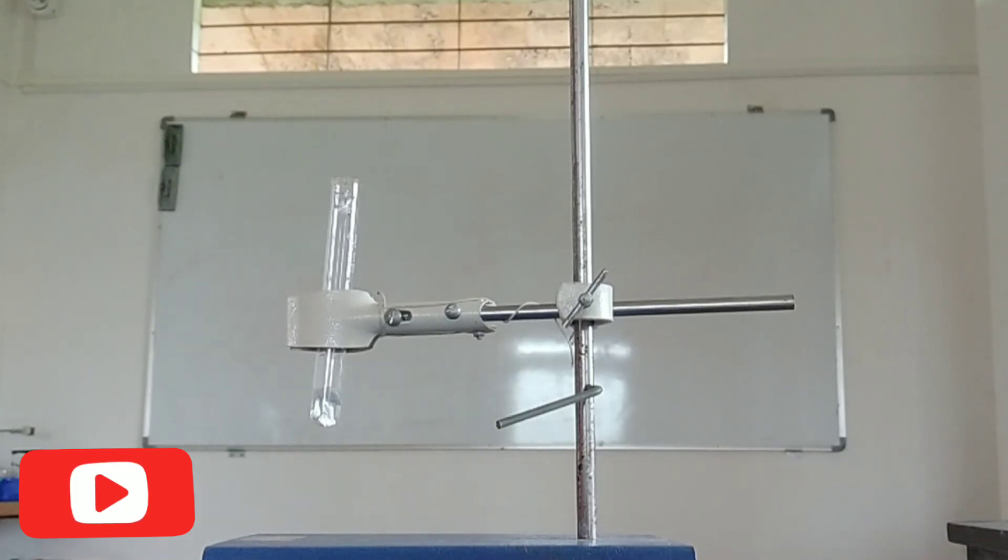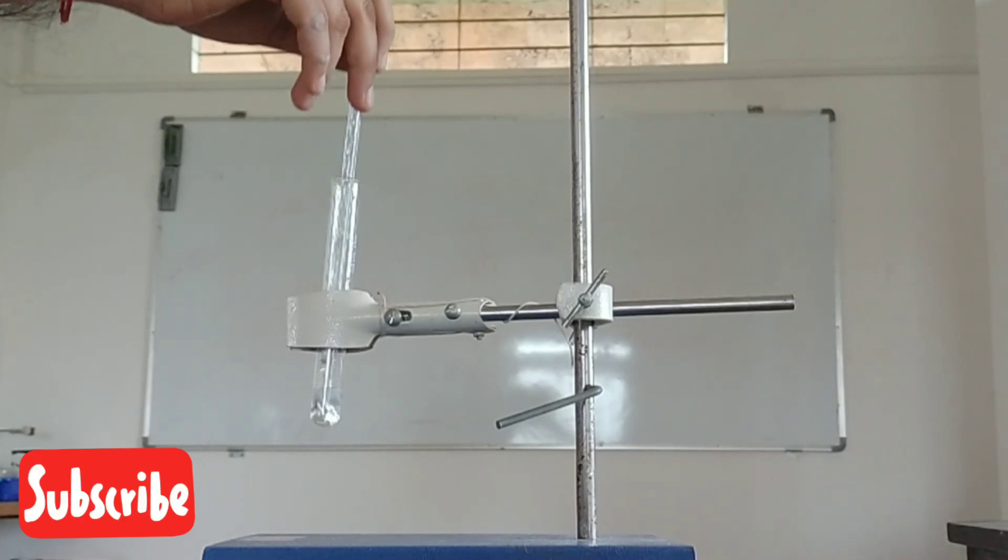I have taken hydrochloric acid in a test tube. Now I will add aluminium metal, that is aluminium foil pieces, to this test tube.